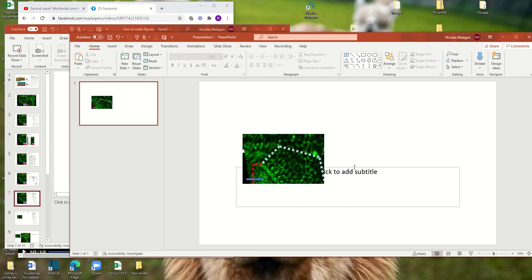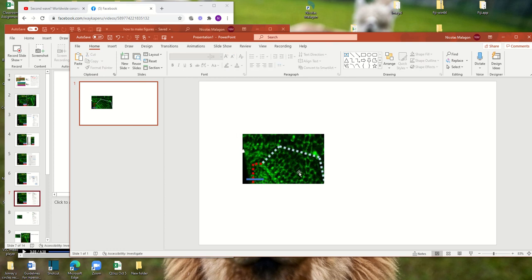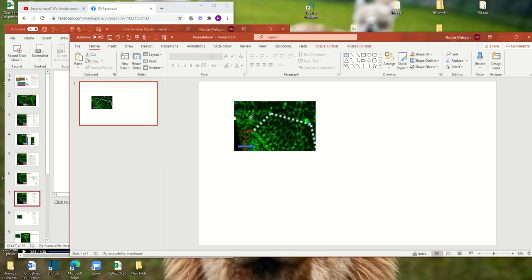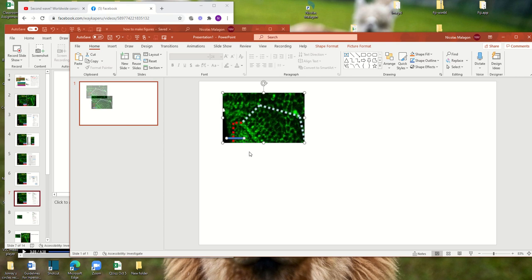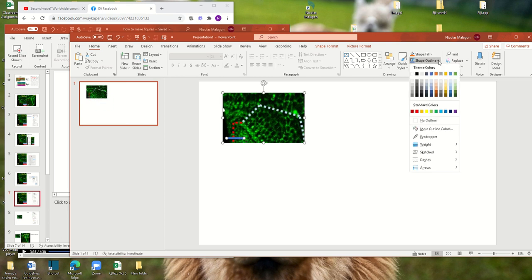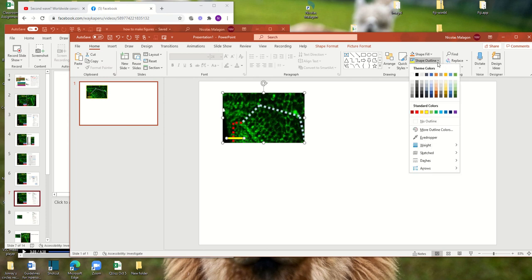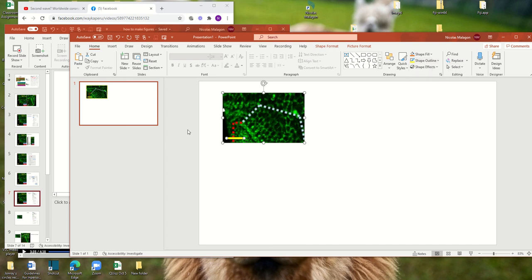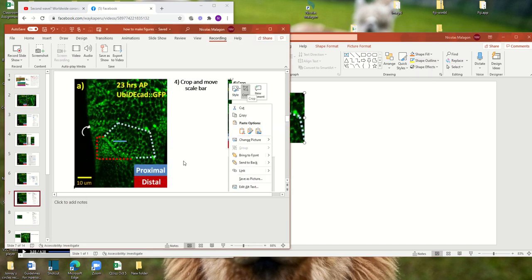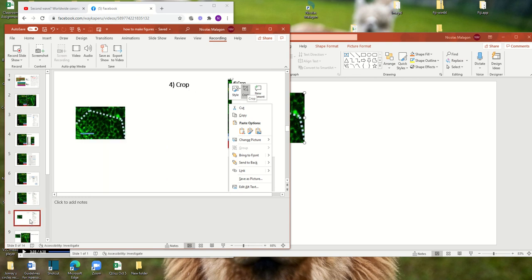But here you still preserve the scale bar. So now you have it there. Maybe the scale bar could be yellow so it's easier to see. And how you do that? Shape outline, and you go and pick the color. In this case, it could be white or yellow.